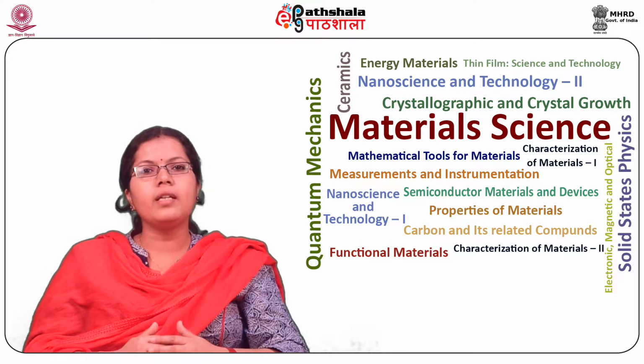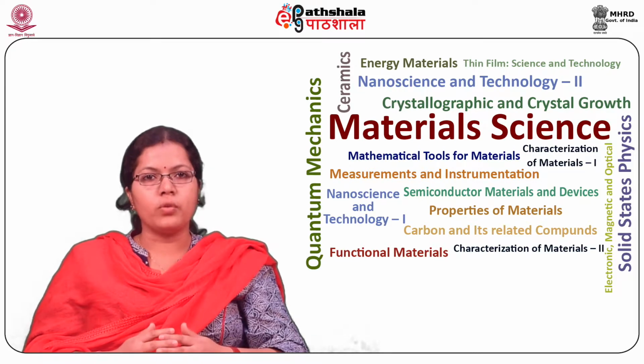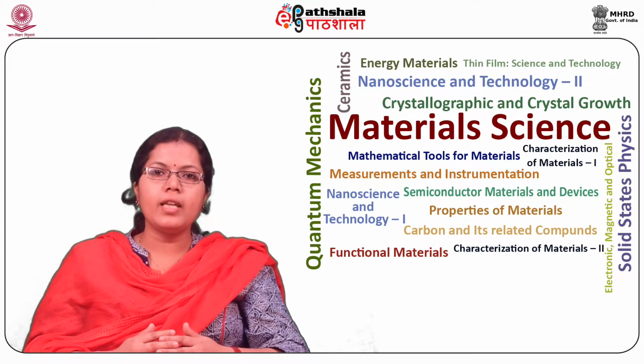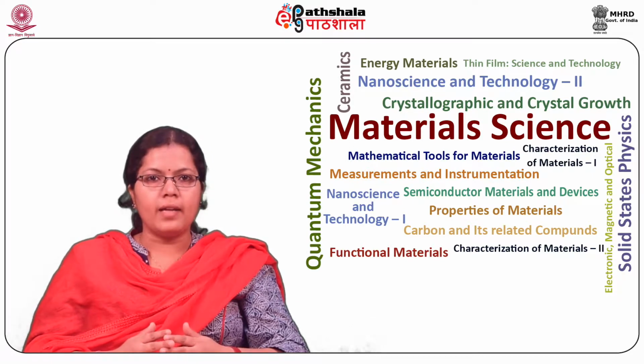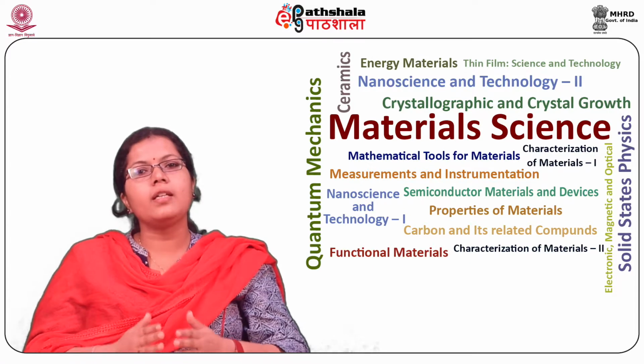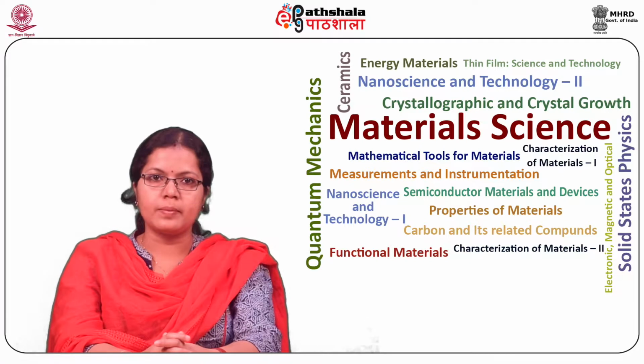Specimens can be observed in high vacuum in conventional SEM or in low vacuum or wet conditions in variable pressure or environmental SEM, and at a wide range of cryogenic or elevated temperatures with specialized instruments.